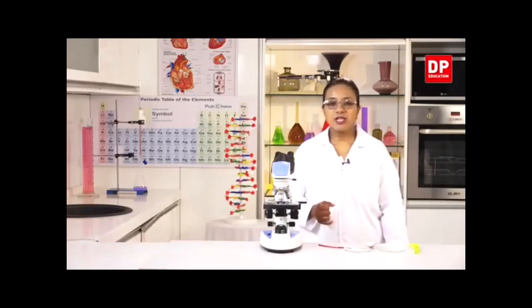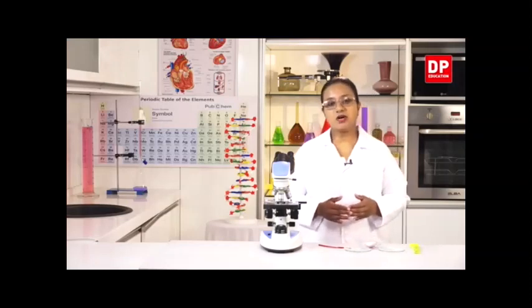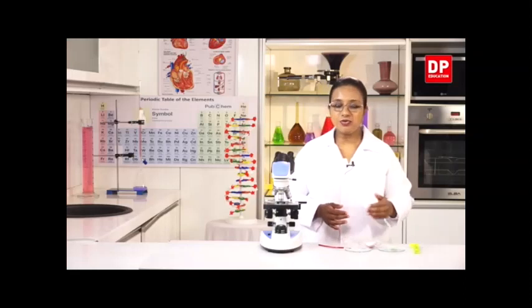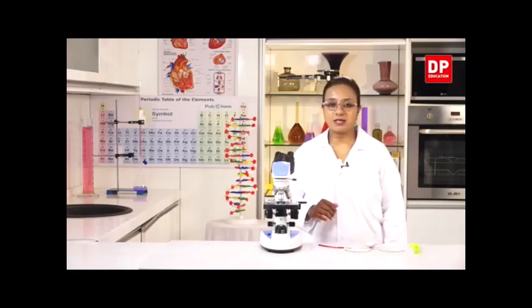Yes, we are going to prepare a temporary slide mount of a plant tissue. For this, I have chosen the onion. We'll be taking onion peels and using that we will make slides, and we will observe that slide in a light compound microscope.